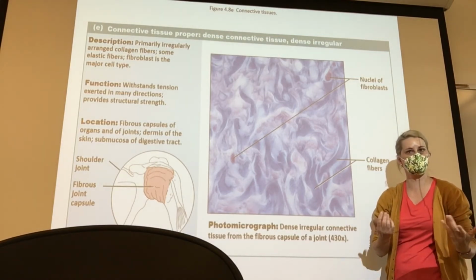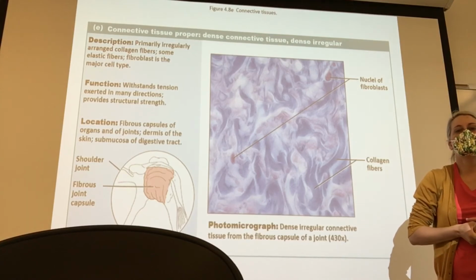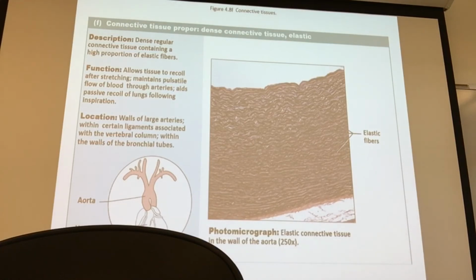Does that make sense? Not a lot of nuclei again. The fibers are all of these, they're just so dense. Another one that, if you rip it, is really hard to repair. You can, but it's not great. Okay, good.